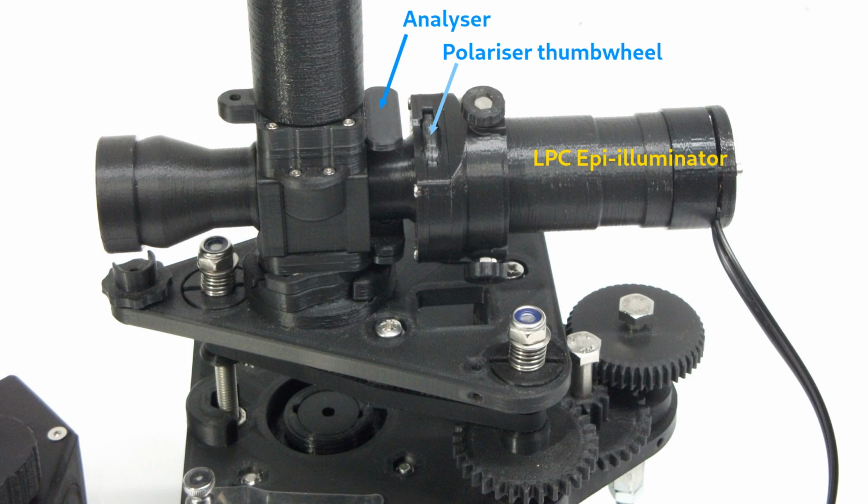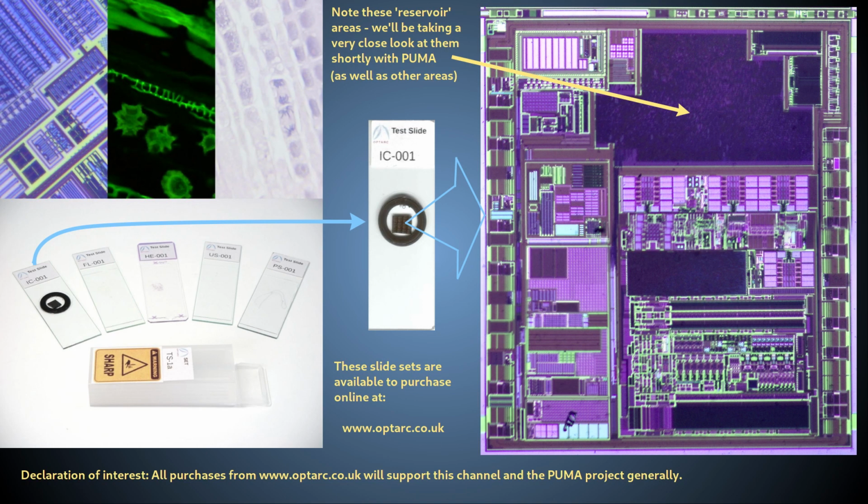The polarizing analyzer is also used in the top filter slot. The specimen is the mounted silicon chip wafer fragment slide from the Optarc test slide set. This silicon chip fragment contains one or more copies of an integrated circuit die.